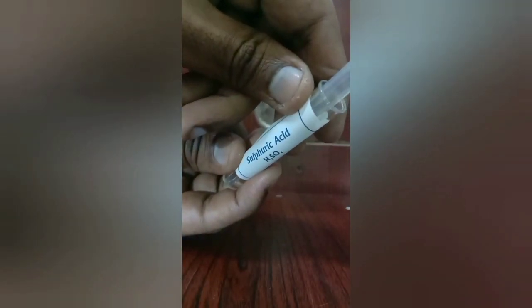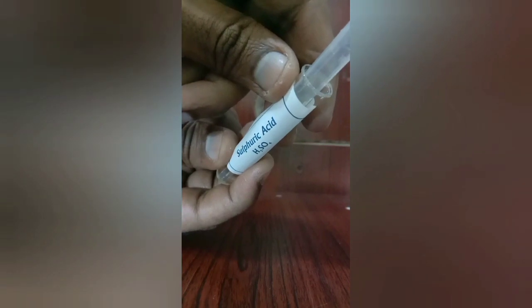Then in your test tube stand, it will be mentioned like this. This type of test tube will be there in your test tube stand. It will be mentioned as sulfuric acid, that you want to take. To this solution, you want to add sulfuric acid, like 2 or 3 drops, that's enough. We are going to add the sulfuric acid to this solution. Why we are adding this is because the ferrous ammonium sulfate crystal needs to be soluble.